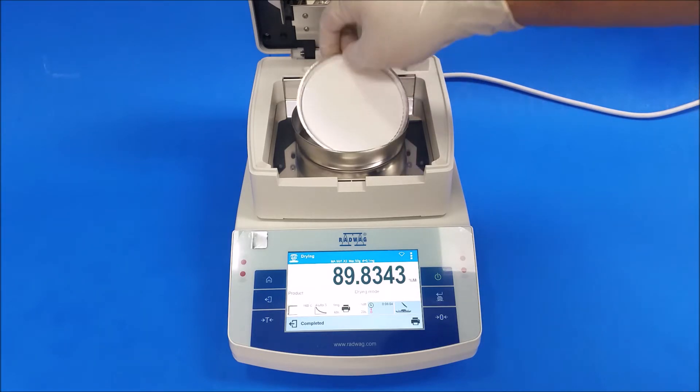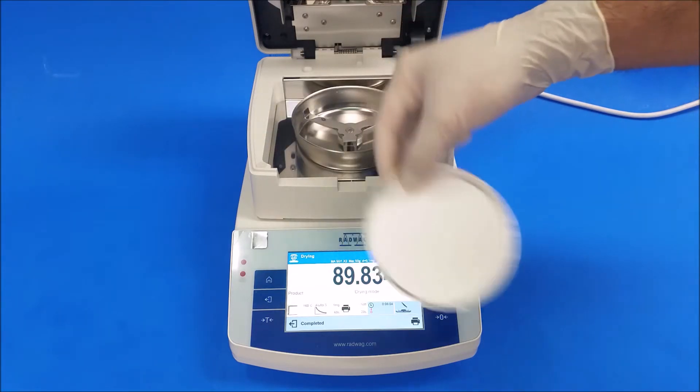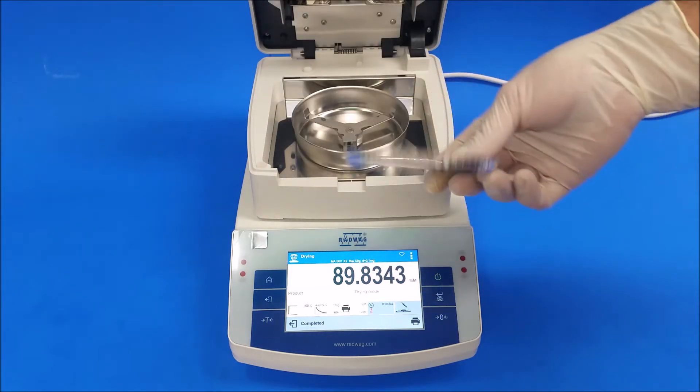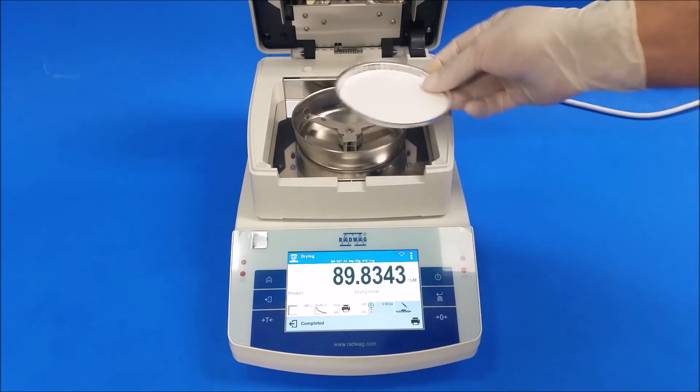You can take this out, but don't reuse it — this goes in the trash. If you're going to run a new test, make sure you get a new aluminum dish and new pads.